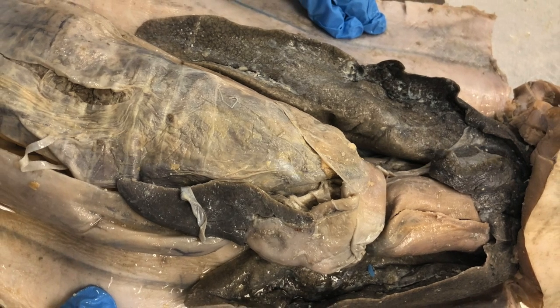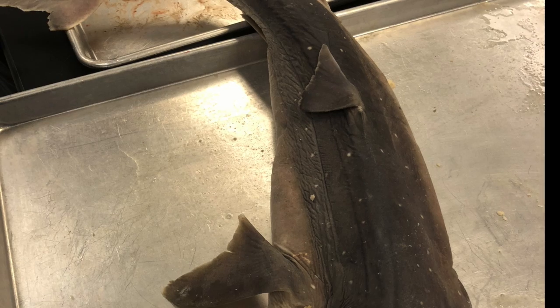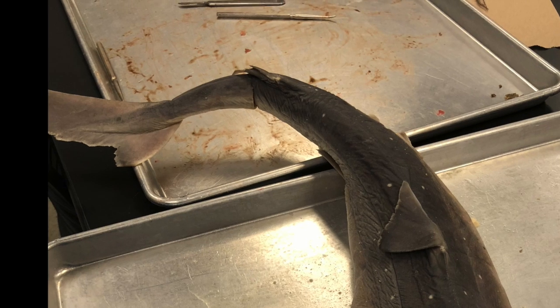Here we have the dissection of the dogfish. Some of the features of this species include a liver, heterocercal tail, placoid scales, and the ampullae of Lorenzini. The liver in dogfish is very large due to the amount of oil present to help with buoyancy. The heterocercal tail of a shark helps give it speed and generates lift.